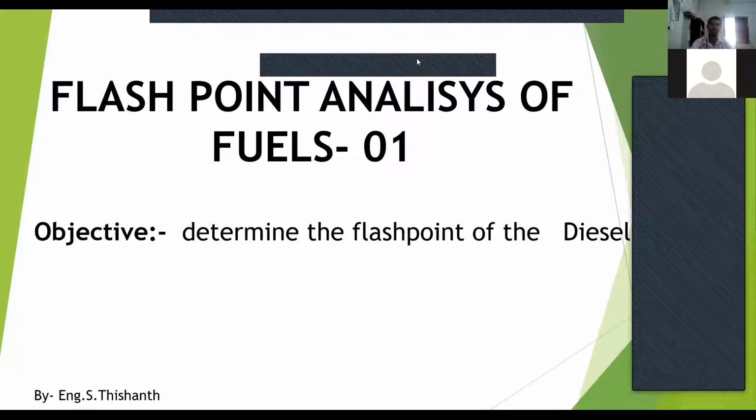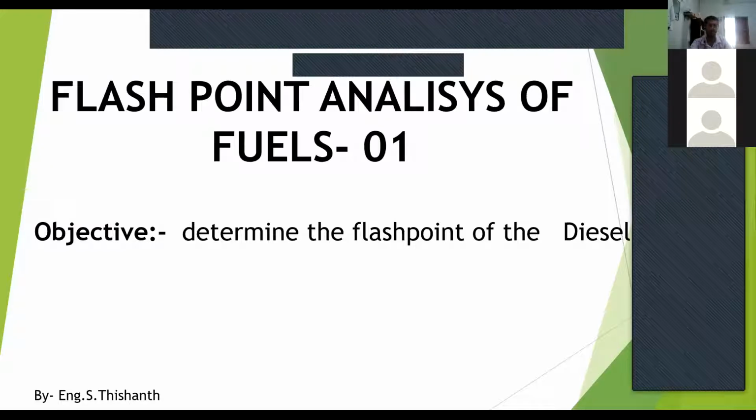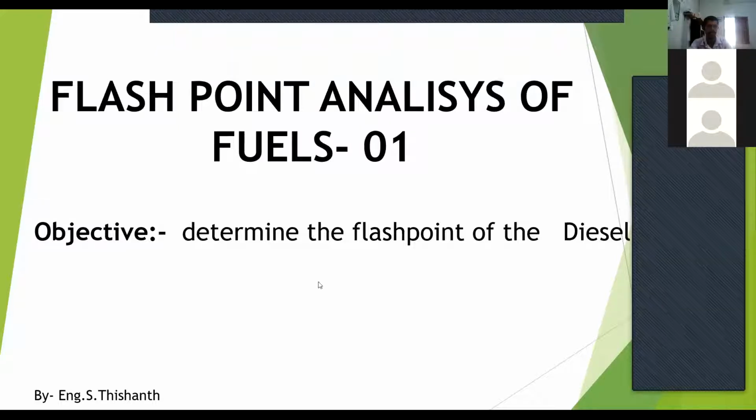So this is about flashpoint analysis, right? Flashpoint is a temperature which changes according to the fuel type, right? There are a lot of applications, and you can ask why we need to find out this flashpoint. That is very important, though it will be covered in the next practical. Applications and uses of flashpoint: why we measure the flashpoint for different oils, fuel oils or different fuels.